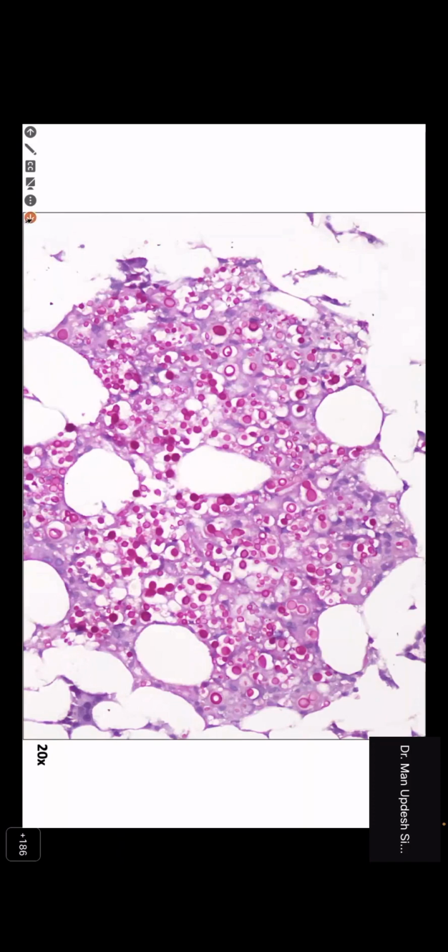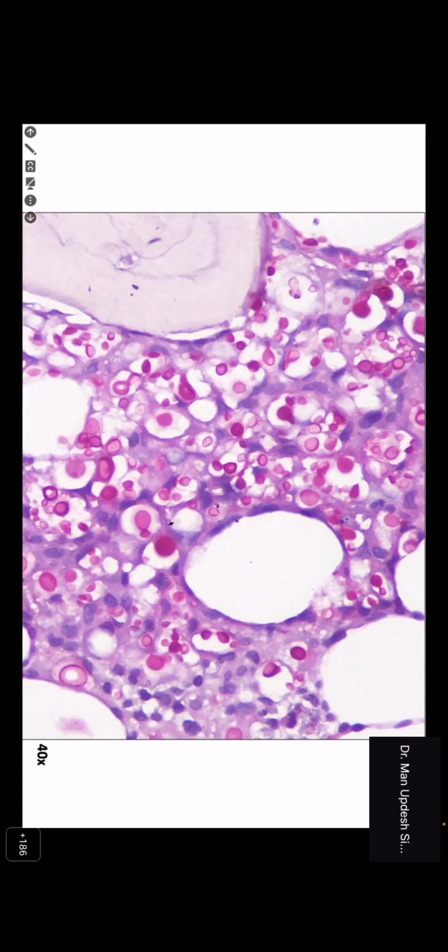Variable size, some of them are really large. Some might be 2-3 microns, but some are really large, 10 microns, as large as some lymphocytes. And anything else which you can do? PAS positive could be cryptococcus, could be histoplasma also. The capsule is not stained; PAS will not stain the capsule. So what will stain the capsule? Silver methenamine stain, GMS. Okay, Gomori methenamine stain, very nice.